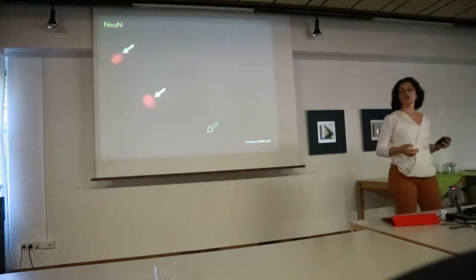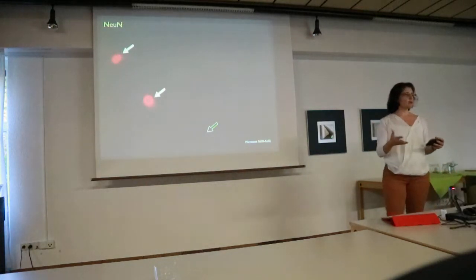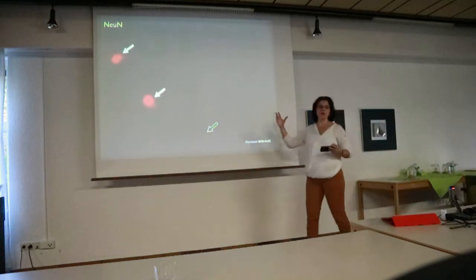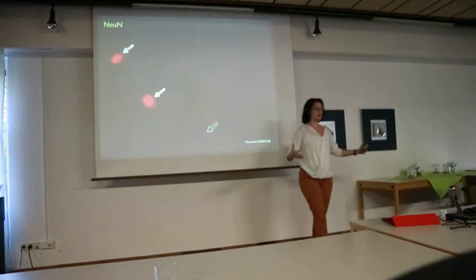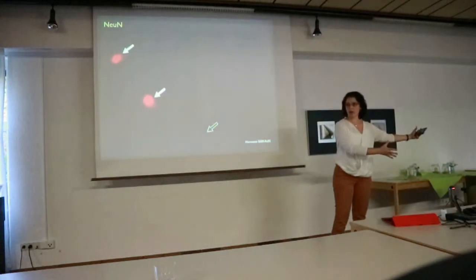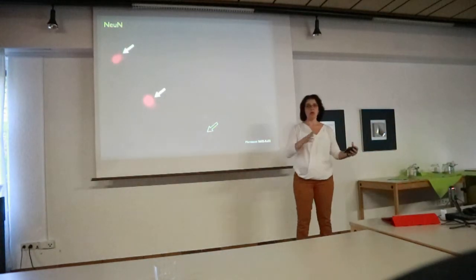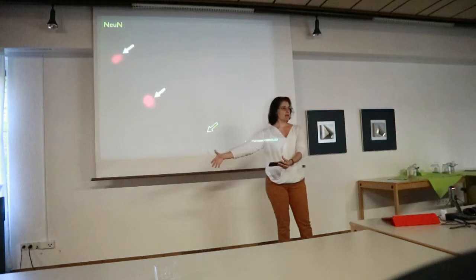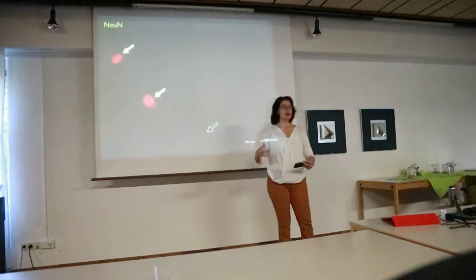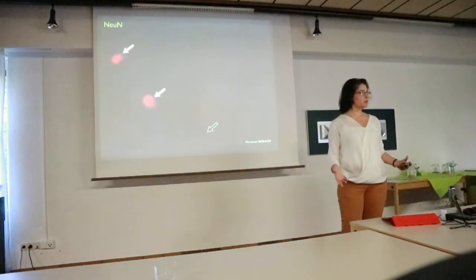this is what it looks like. So you see there's essentially 0 background here. It's very easy to tell what cells are neurons. And therefore, in not more than a few hours, you know how many cells your original structure had. You know what fraction of them were, in this case, neurons. By subtraction, you know how many non-neuronal cells, glial cells, and vasculature you had. And now that we have other nuclear markers that can identify different cell types, we can use that as well.